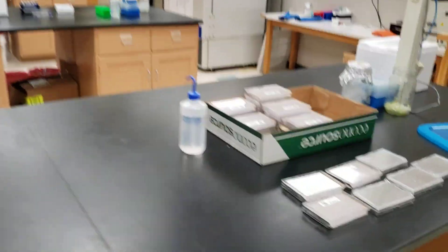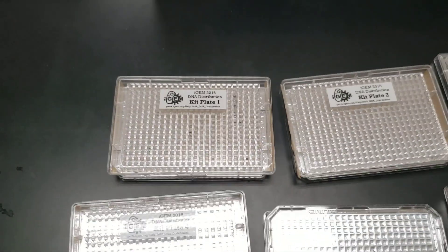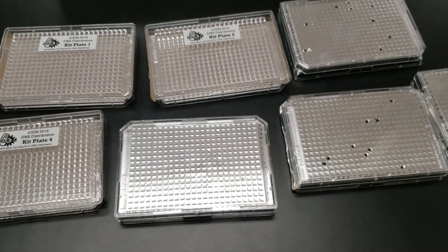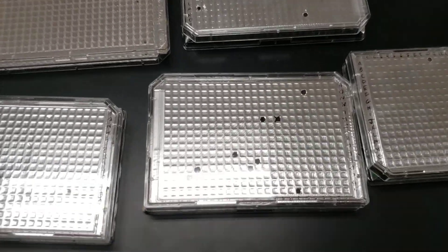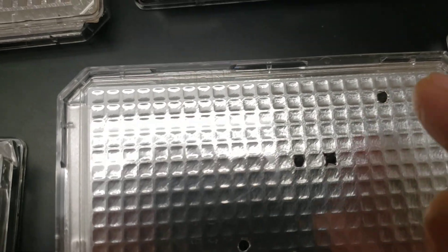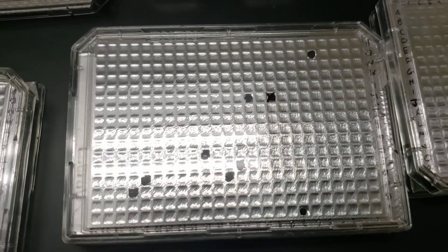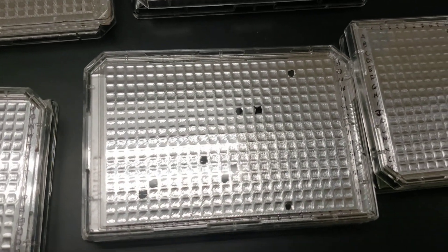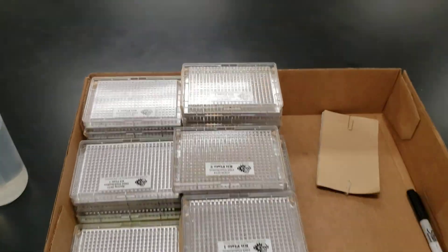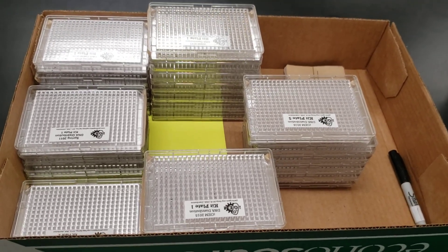When you order the iGEM labs program, you receive kit plates. Each kit plate has 384 wells, with each well containing a different plasmid — all freeze-dried and storable at room temperature. Students look up the key and orientation of the plasmid they need. I mark the spot, puncture the tin foil, add liquid to reconstitute the plasmid, pull it up, put it into a microcentrifuge tube labeled 'class stock,' give students a few microliters, and store the rest in a separate lab. I've been doing this since 2011 and we have a ton of plates.